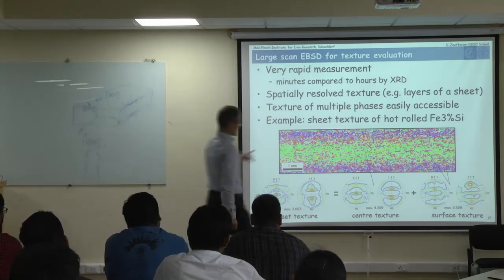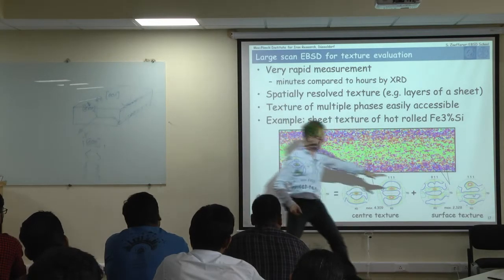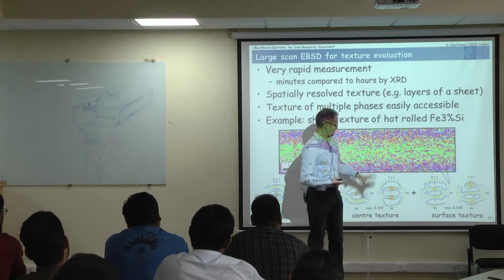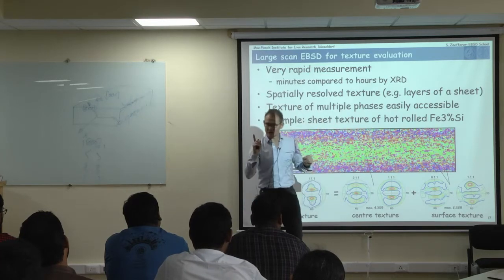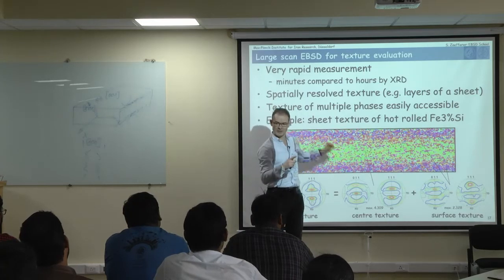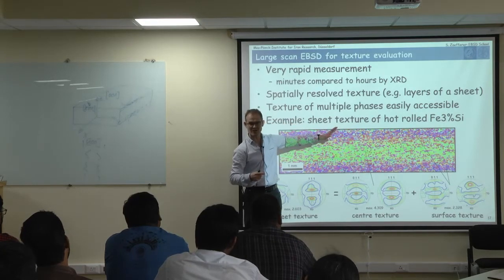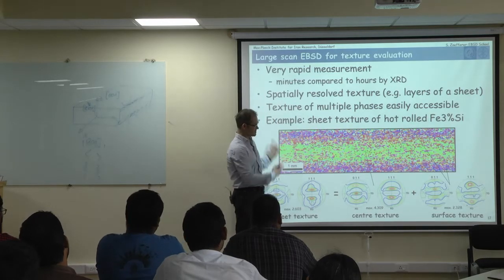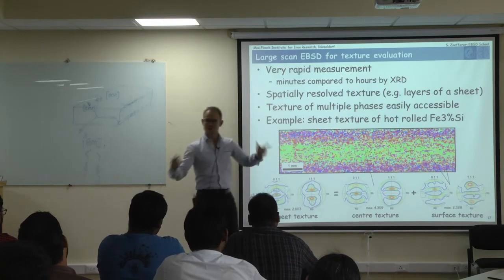And actually, these pole figures here look symmetric. There is a clear symmetry, but they look only symmetric because I took the lower one and the upper one and added them together. If we look into the lower one only or the upper one only, we will find out that it's actually not symmetric. The lower one has an inclination like that and the upper one has an inclination like that. That is because they were rolled in a well-defined direction, and the shear force which is creating the deformation is not symmetric.